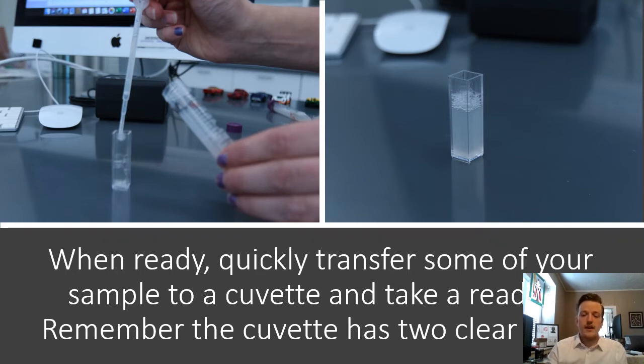When you're ready, you'll be transferring some of your sample to a cuvette, and remember that's just the fancy term for the rectangular prism that you're using to put into the colorimeter. It's a specific shape, and the colorimeter knows how transparent the edges are, so you have to use the specific tool that comes with the colorimeter. With these, there are two clear sides on opposite ends and then two fuzzy sides. When you load it, you have to make sure that the two clear sides are what's being measured, the light going through it.